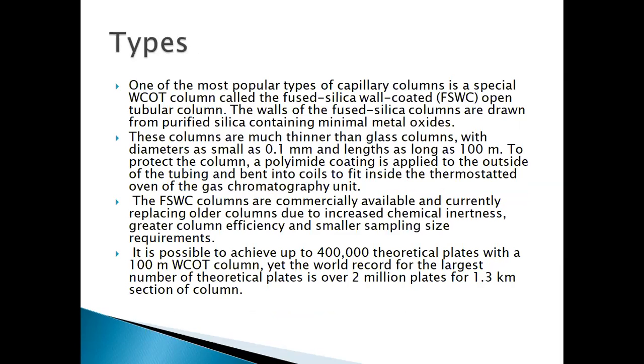The walls of fused silica columns are drawn from purified silica containing minimal metal oxides. The columns are much thinner than glass columns, with diameters as small as 0.1 millimeter and lengths as long as 100 meters. To protect the column, a polyimide coating is applied to the outside of the tubing and it is wound into coils to fit inside the thermostated oven of the gas chromatography unit.